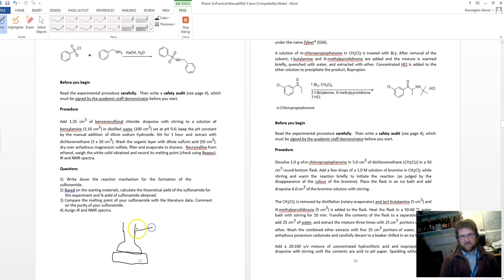So it should be clamped with the boss onto the stand, and then the hot plate stirrer should sit onto the stand, right in that manner. So you have a clamped flask here, clamping on the neck, and your electrode should be placed into the stirred solution. This is the electrode, the wire, and that should be clamped at that position.